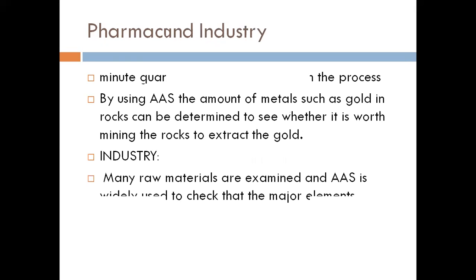So next one is mining. By using AAS, the amount of metal such as gold in rock can be determined to see whether it is worth mining the rock or extracting the gold.